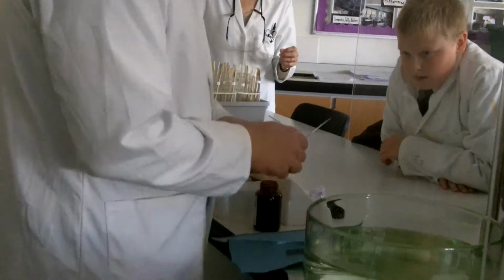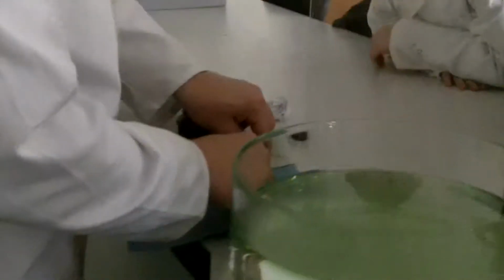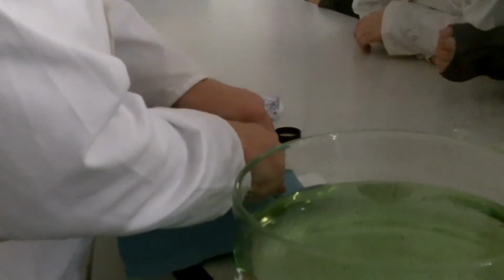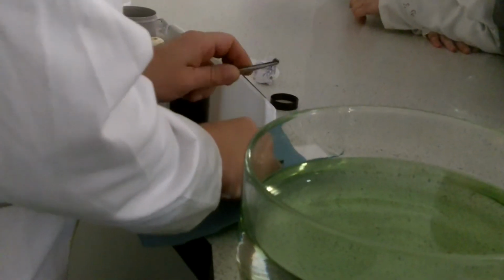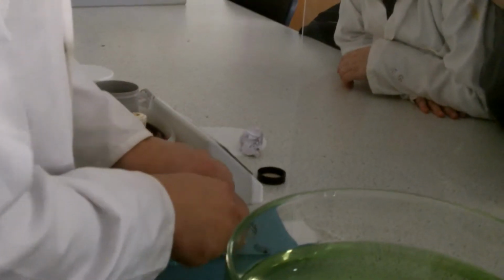Got to cut it. And I'll show you that it is a metal. It's actually quite easy to cut. It's probably got the consistency of really hard butter. You can see it there, it's metallic. The reason that it is dark on the outside is because it's tarnished. It oxidizes with the air really, really quickly.